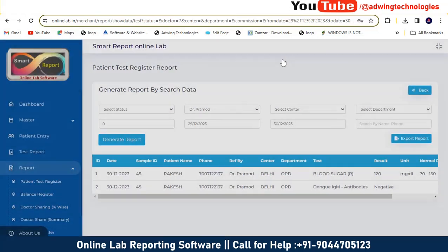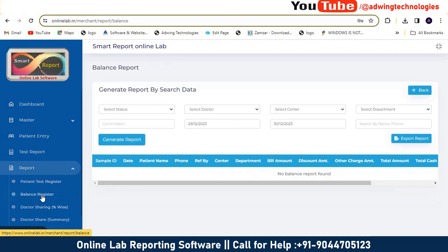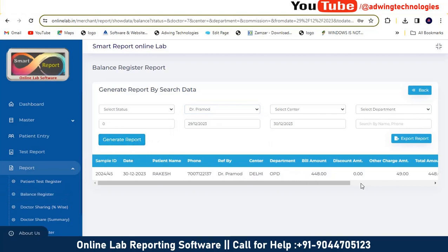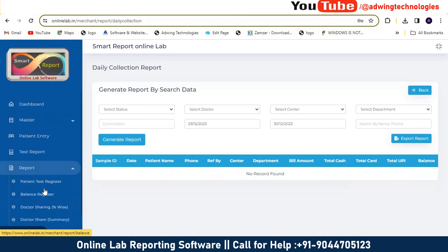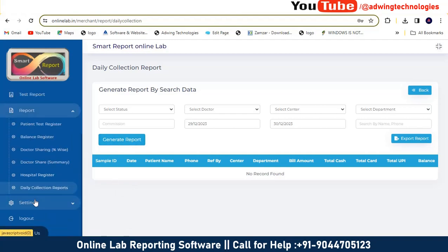You need the password again. Similarly, balance register, if any, you can check by doctor. You will see there is no balance. Similarly, daily collection report, hospital report, you will get everything in this software.